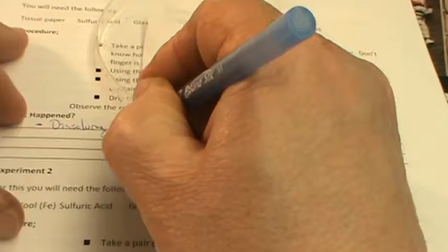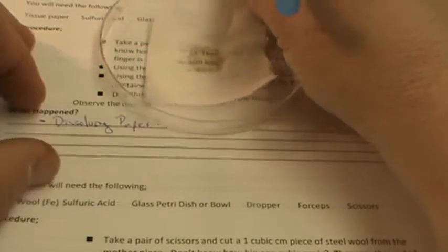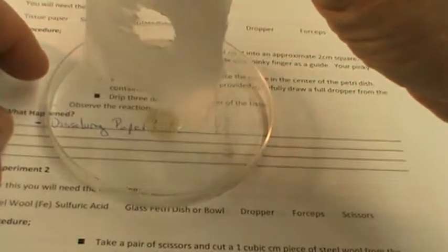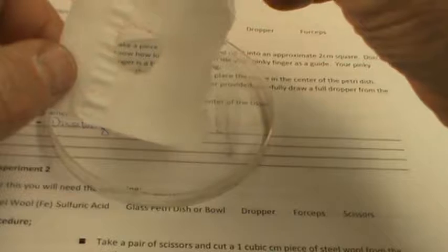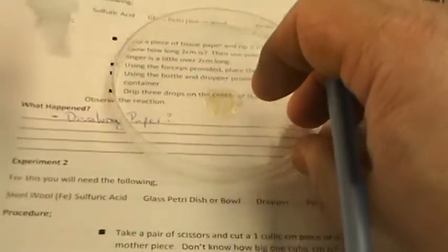We are dissolving the paper? If I take hold of this little piece up here and lift up, oh my gosh, look at what just happened. There's a hole in my tissue paper. And let's look around the edge. It looks kind of burnt. That is a chemical burn.